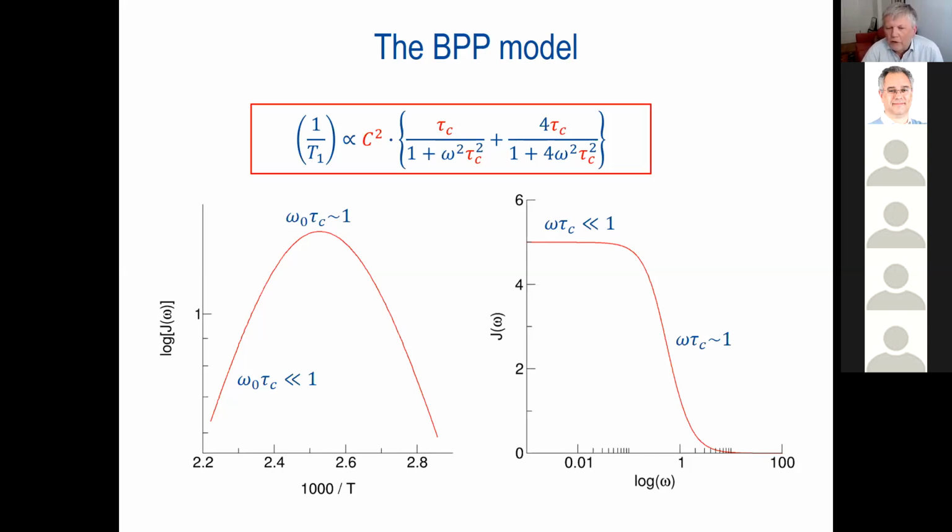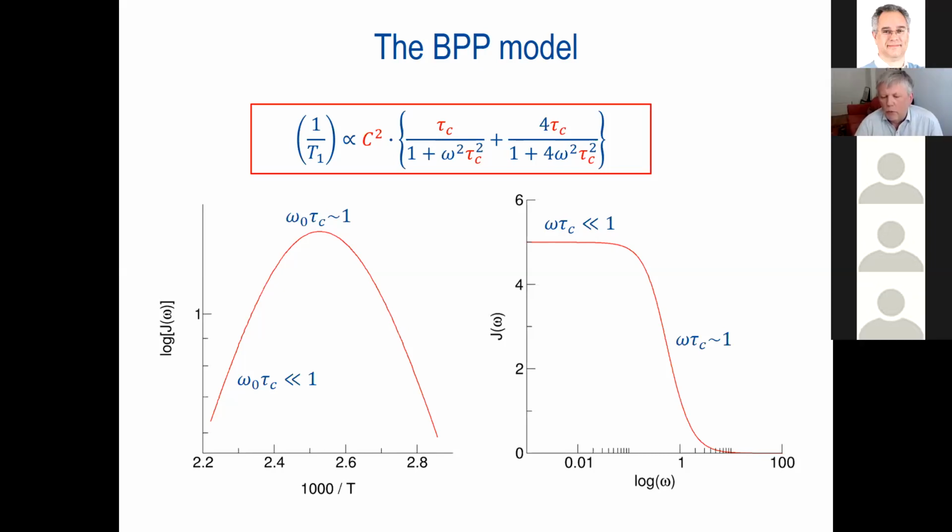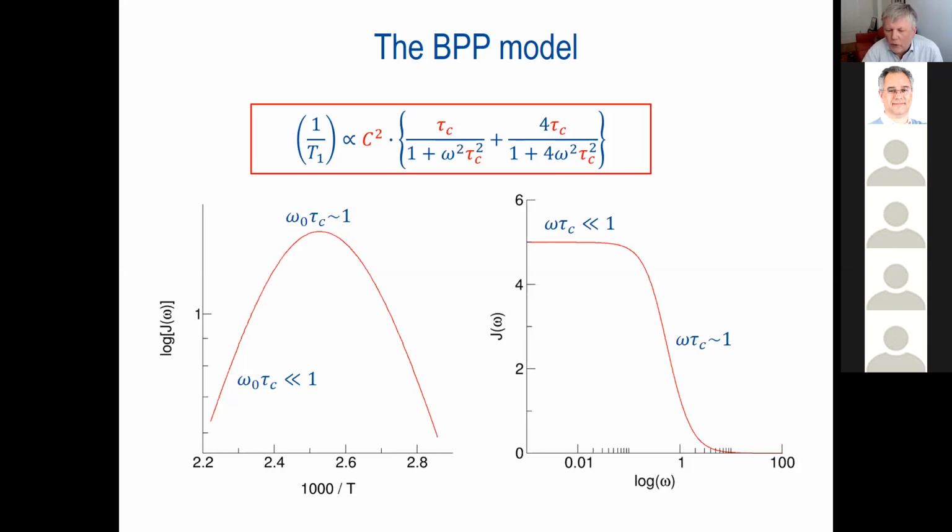So to the right, you see the diagram we know from field cycling relaxometry, where we can cover a large frequency range, and we are also happy that at higher frequency we can eventually escape the extreme narrowing case. So then we don't have a flat curve anymore and get additional information, because only if we have large enough correlation times and high enough frequencies, we can get this relation as shown, this equation as shown on the top.